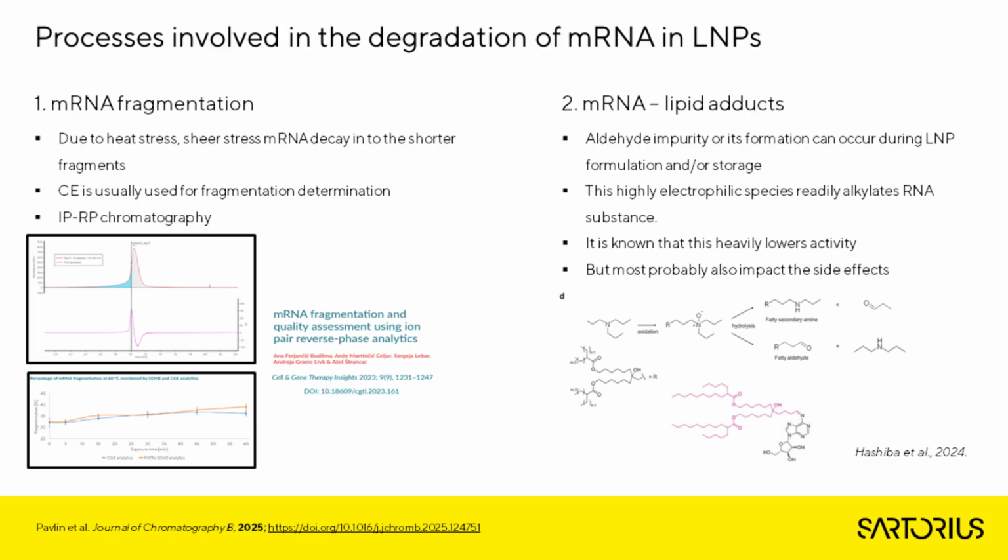We compared the results obtained using this technique with capillary electrophoresis results, and you can see that the results are the same. So this confirms that this technique can be used for the determination of mRNA fragmentation. The second process involved in degradation of mRNA in LNPs is the formation of mRNA lipid adducts.